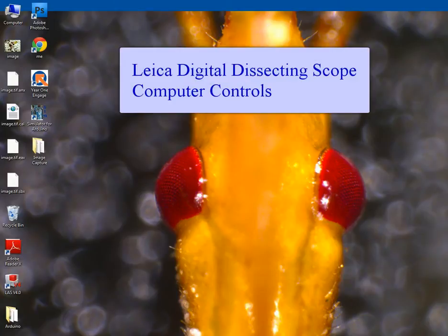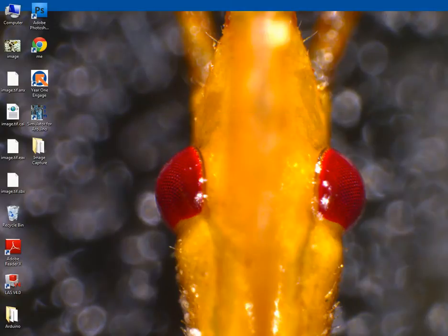We've looked at the physical controls on the microscope, the Leica Dissecting Microscope itself. Now let's play with the program.